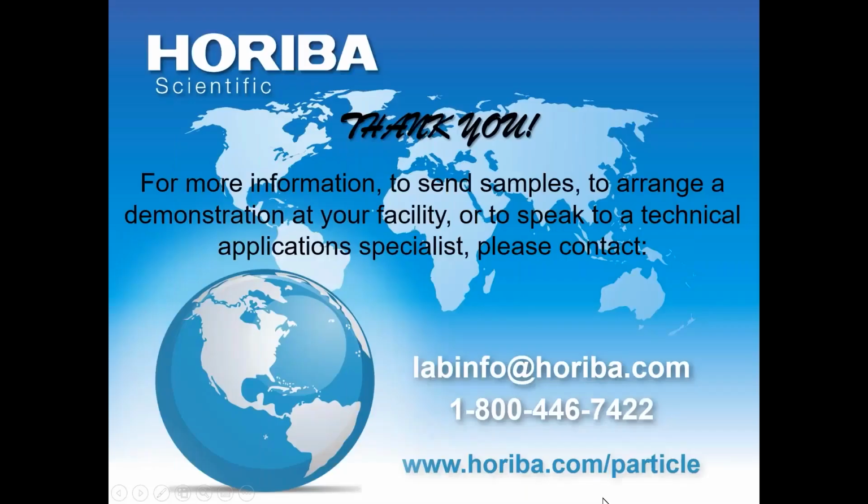So I hope that I've been able to persuade you that zeta potential measurements can be especially useful in formulation and application of particulate suspensions. And rather than being an often underutilized, even neglected technique, zeta potential should be considered as a necessary primary particle characterization method. Thank you very much for your attention.